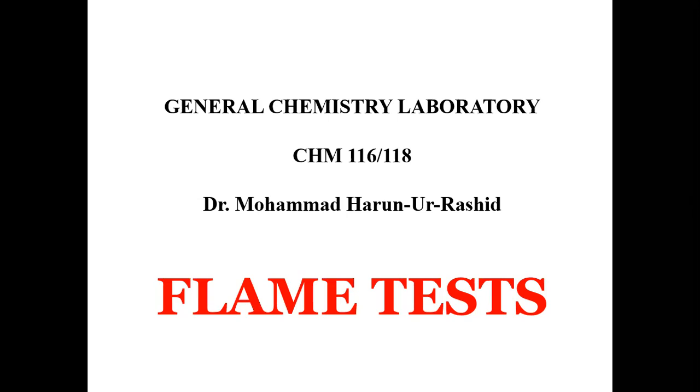This oxygen will completely burn the natural gas coming to the Bunsen burner, thereby producing a non-luminous flame. Now, in the case of the flame test, as this test depends on the color of the flame, we need to create a non-luminous flame to identify the change that is happening to the flame color, because the very basic of this test is to observe the flame color and identify the existence of a metal ion.